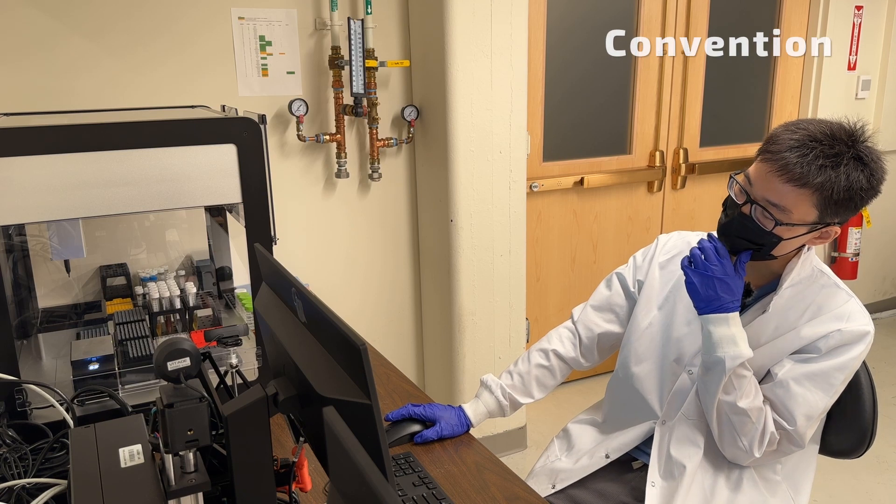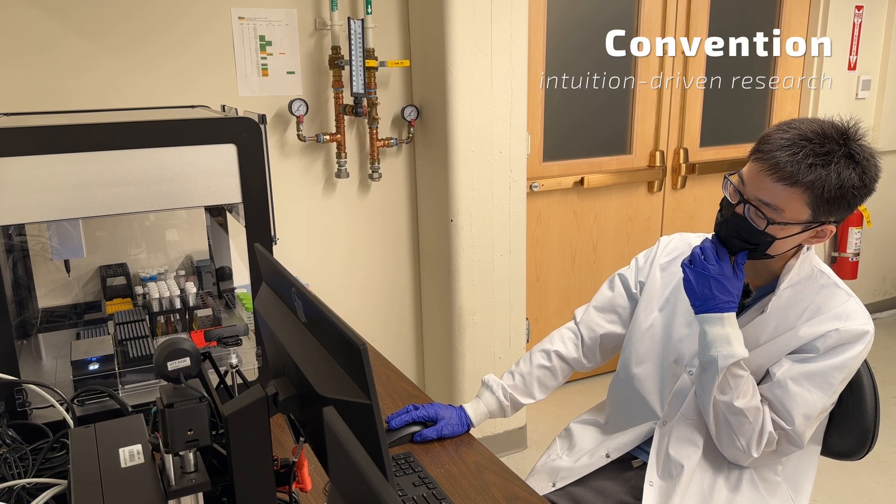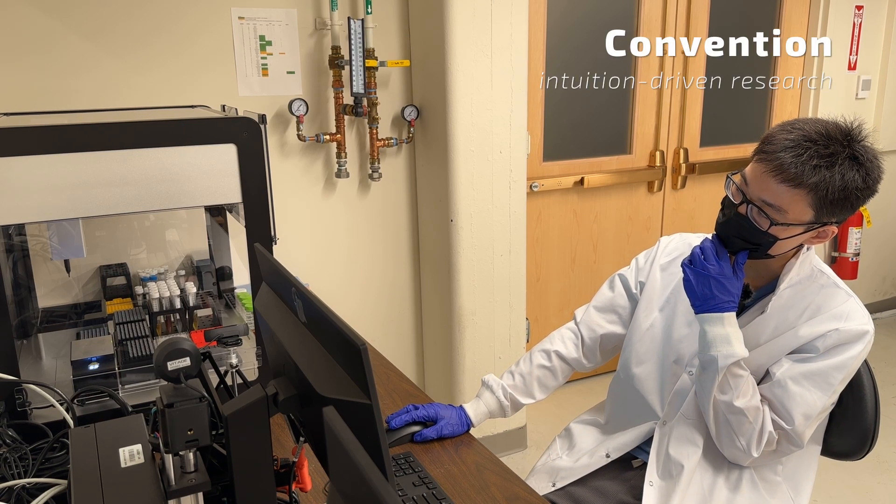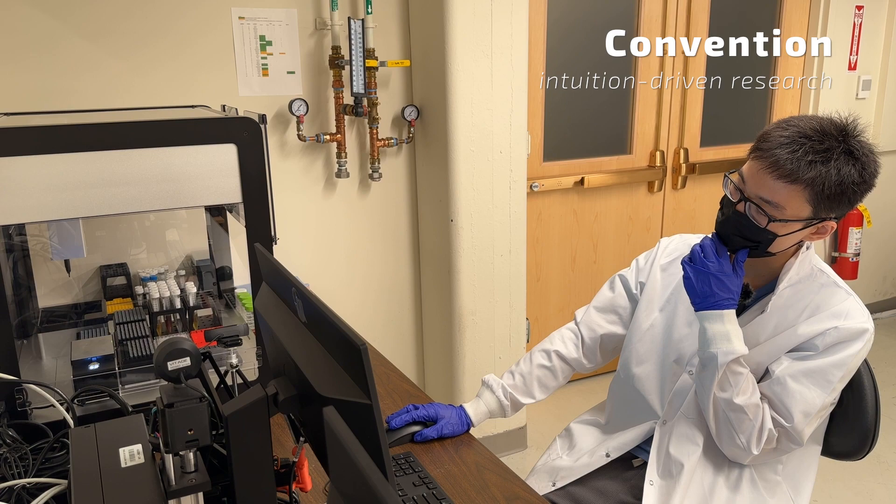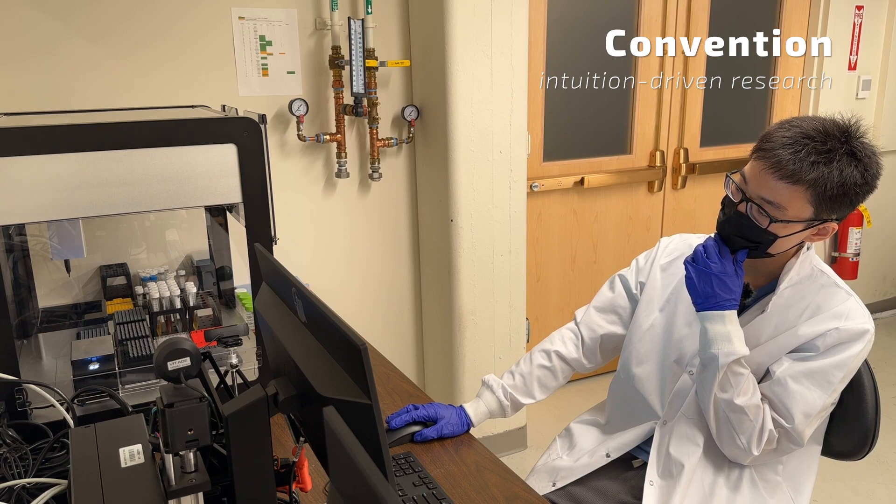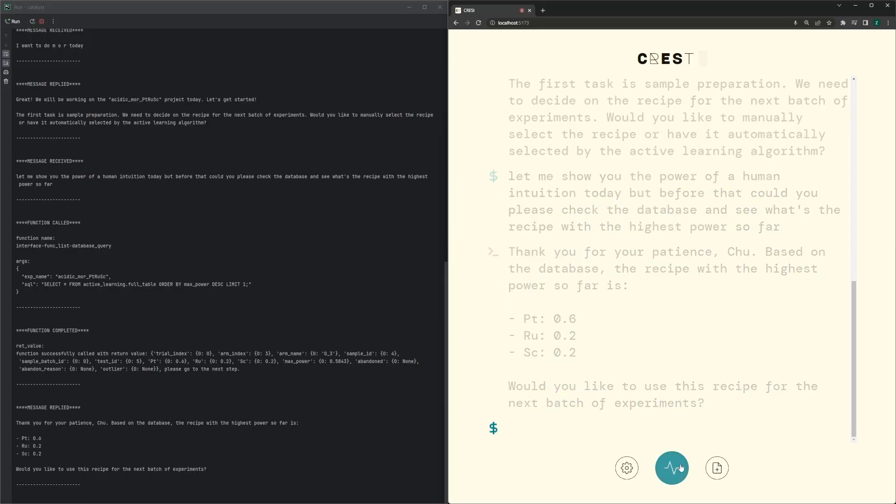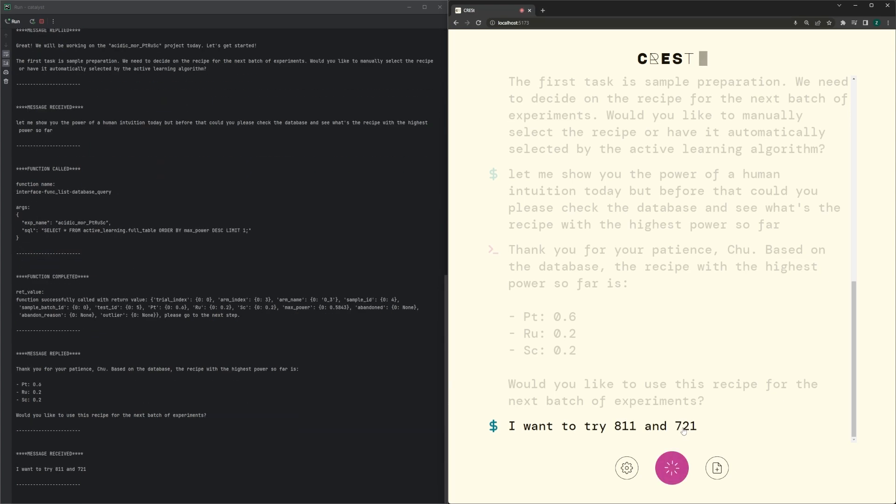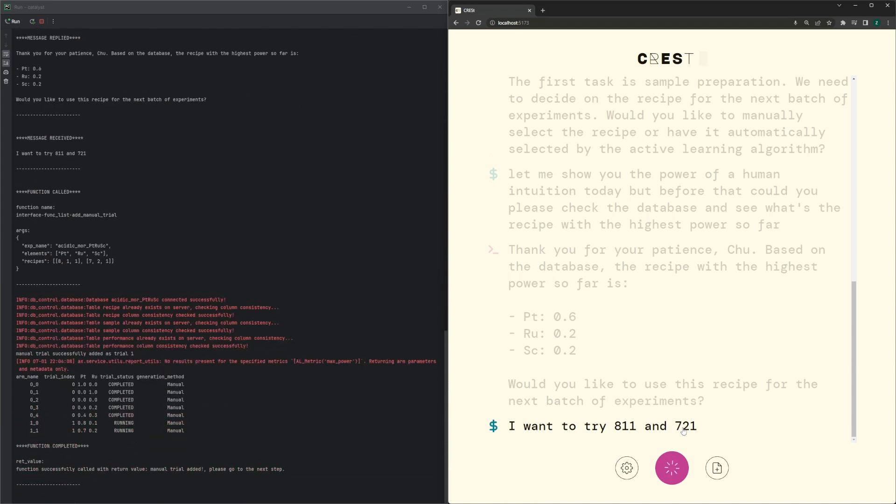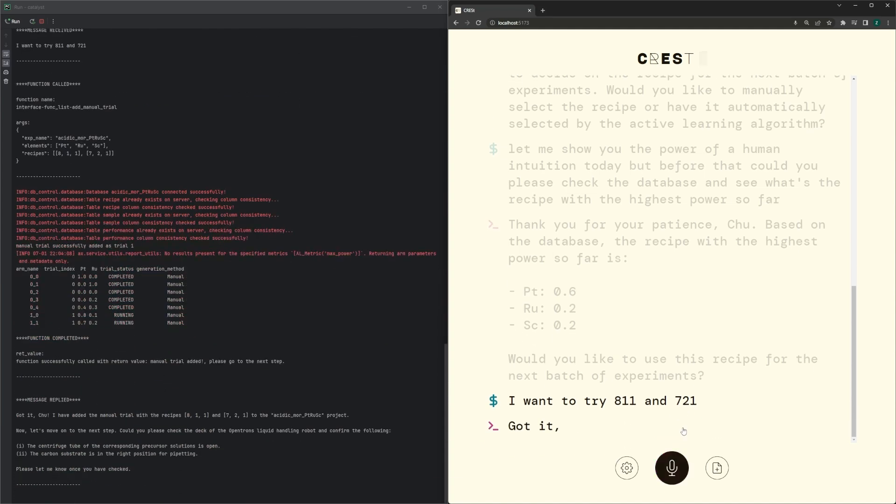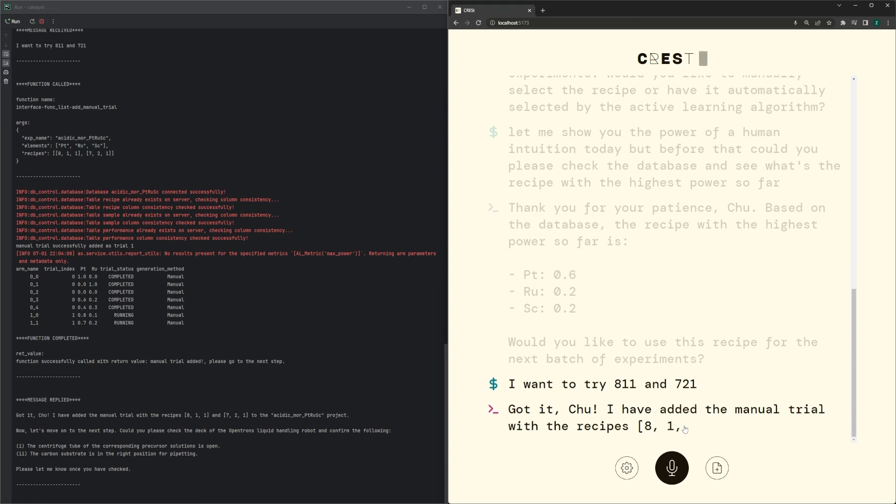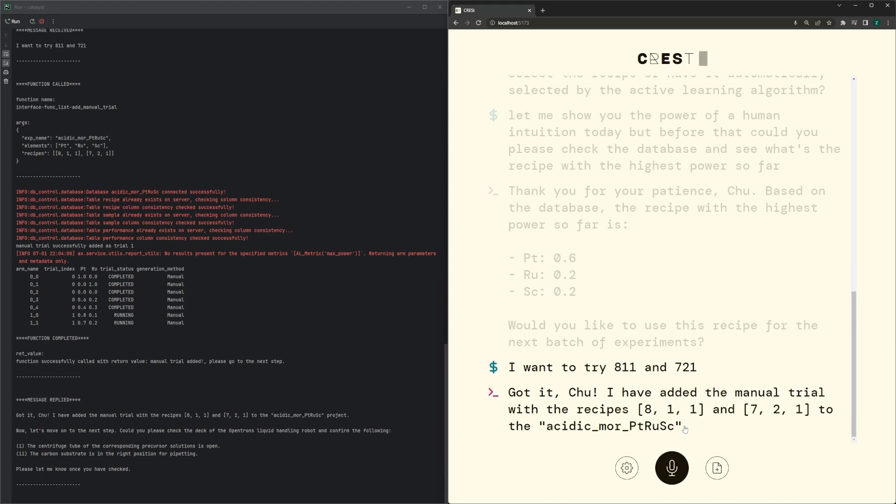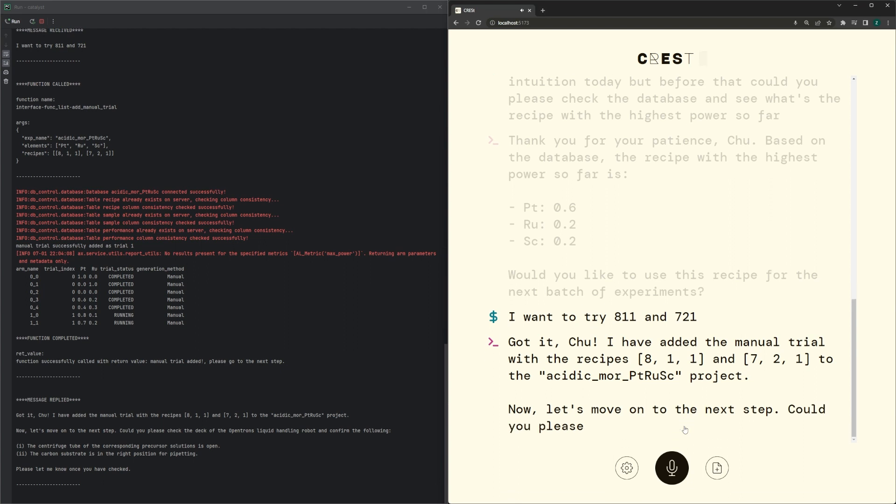Hmm. Scandium is not that active in MOR. Maybe I can decrease that a little bit. I want to try 8-1-1 and 7-2-1. Got it, Chu. I have added the manual trial with the recipes 8-1-1 and 7-2-1 to the Acidic MOR Platinum Ruthenium Scandium project.